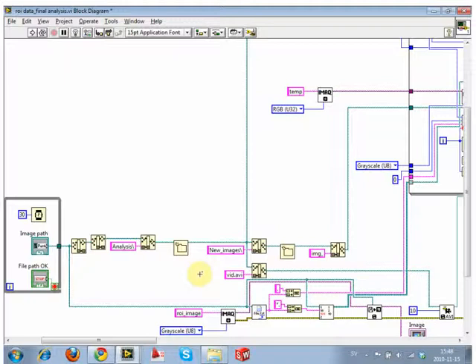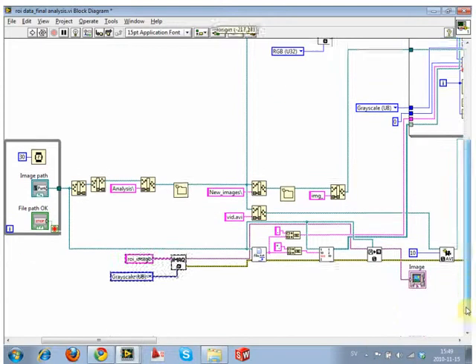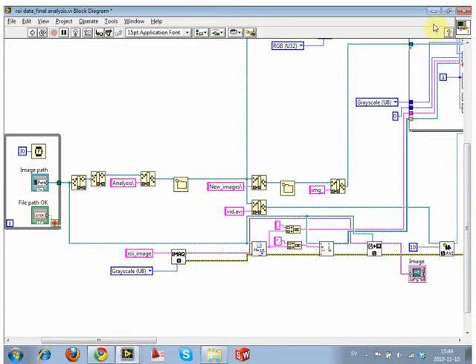One of the things from the previous group was, but what if you want to filter, say, the confocal data? Can you add that in there? And there is a way. And what I would do is we can actually build that together first and get things rolling that way. Rather than having to explicitly type all of the tokens and switches with the file name, we want to make it very simple so that errors happen the least number of times.